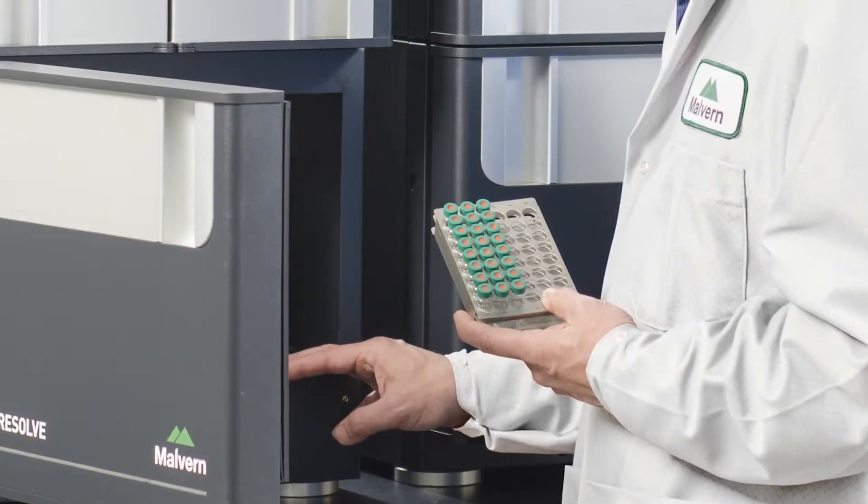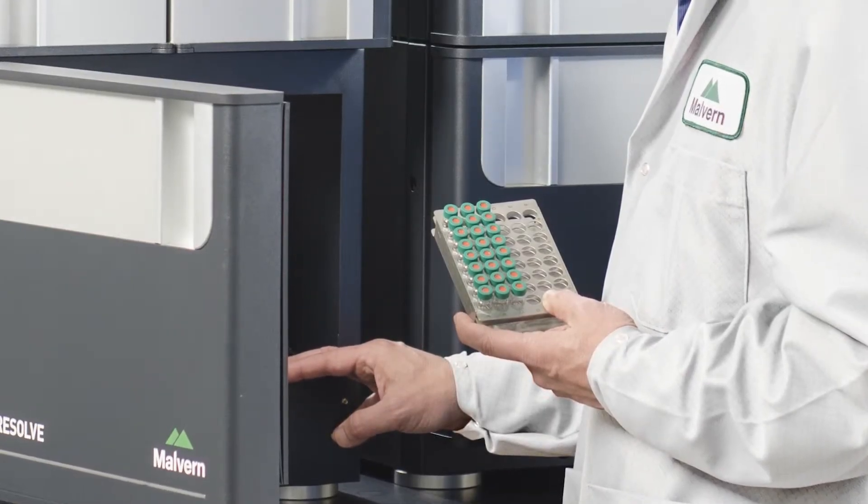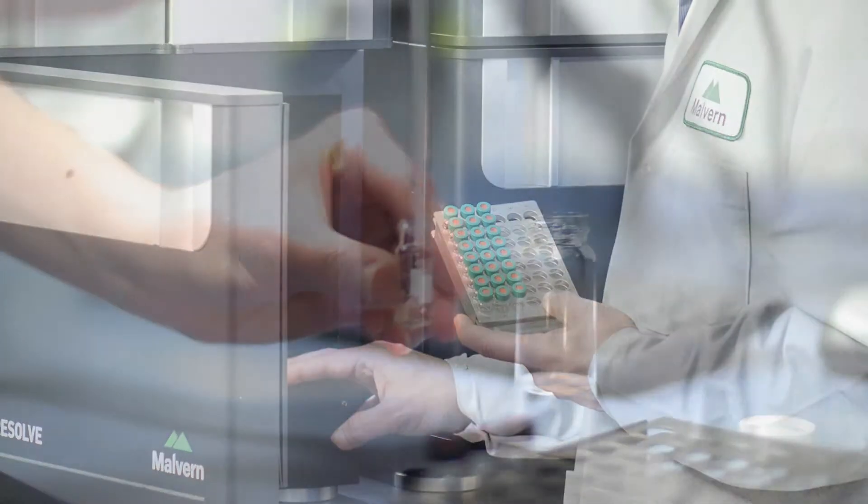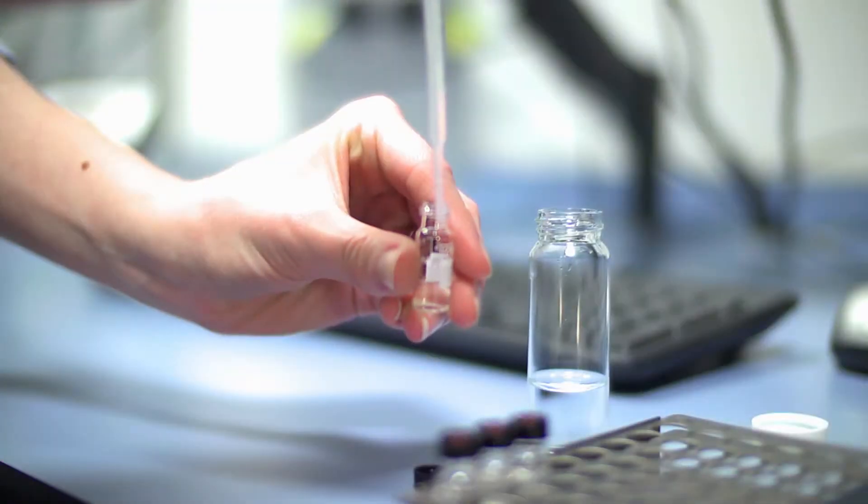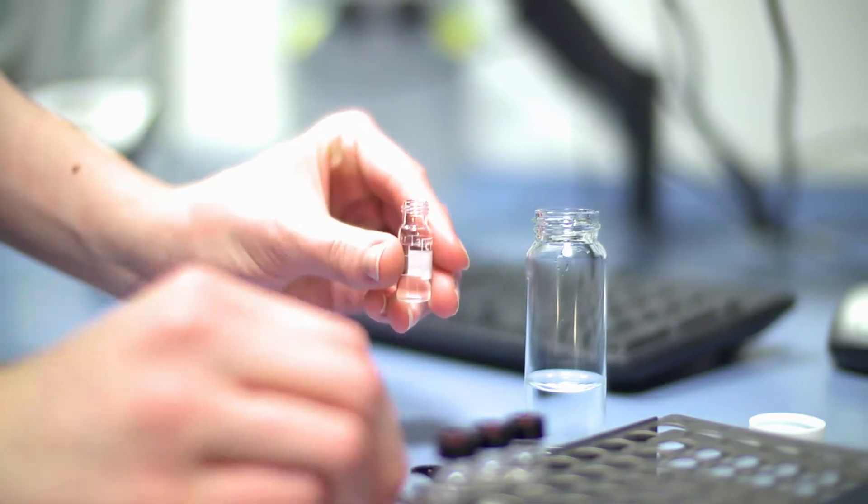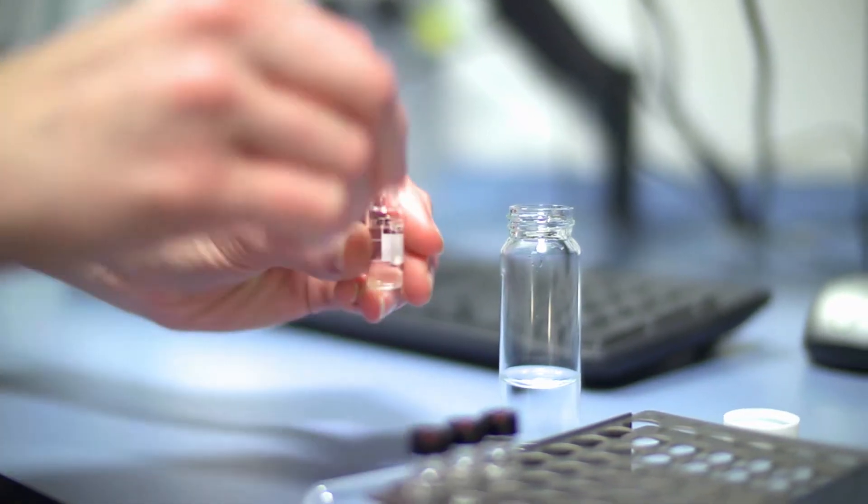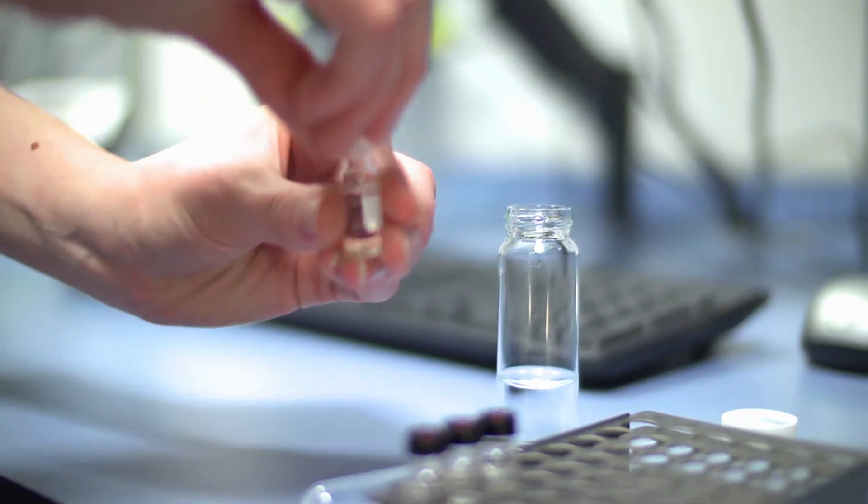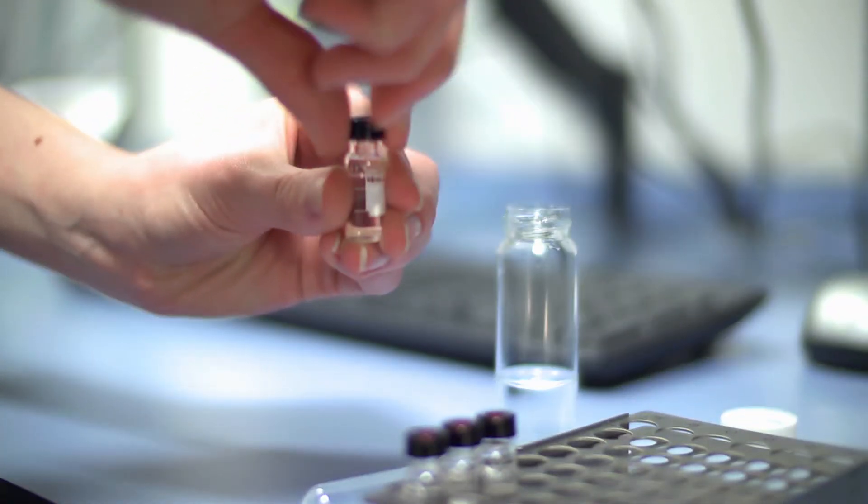Within industry, it will be used in research departments where people are developing novel polymers or even just characterizing their current products to a higher level.